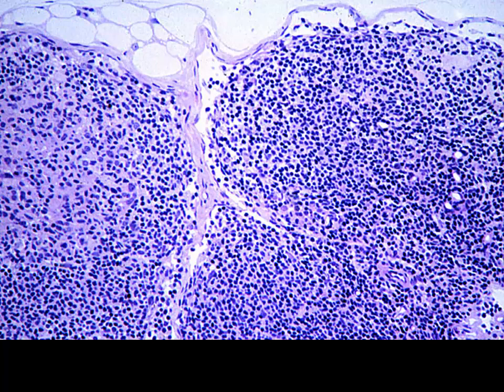Now here we have another image showing our capsule on the outside. We've got our subcapsular space here. Now the capsule, you can see it very clearly diving down. And as it dives down, we are going to continue this space or sinus running along with the trabeculae.